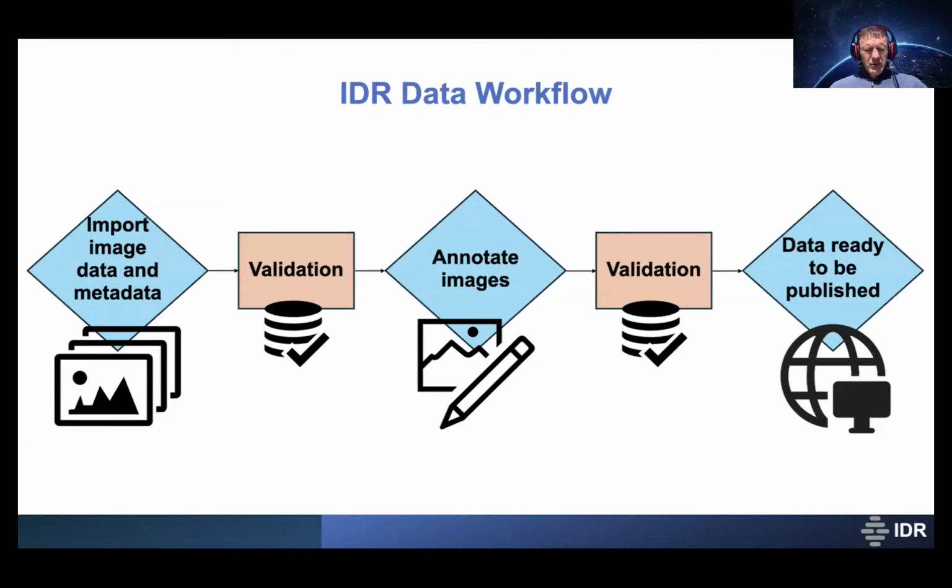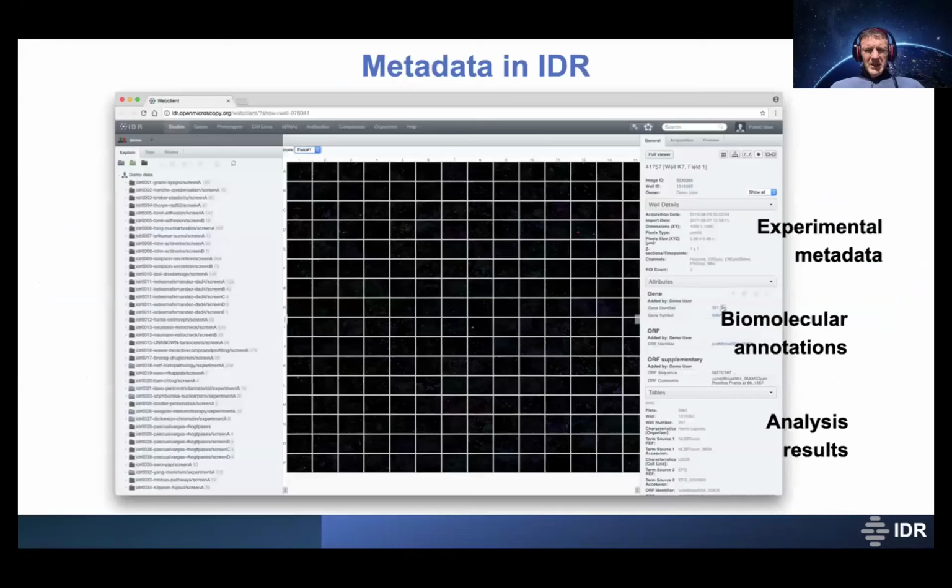Often we get the question, how long does it take for publication? I would say, how long is a piece of string? It really depends how good you have been with your data from day one. And as we have seen, in many cases, images can be composed of multiple files. They delete a file because it's not useful. Well, the library that we use, Bio-Formats, said the data are not complete, so we cannot accept. Very simple.